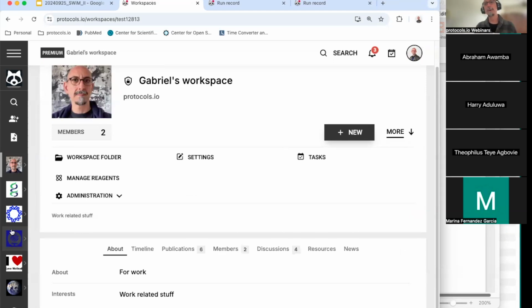I'm going to pause for a moment so you digest and you think about some questions about how to create protocols and create workspaces. And you can start typing those questions in the chat.